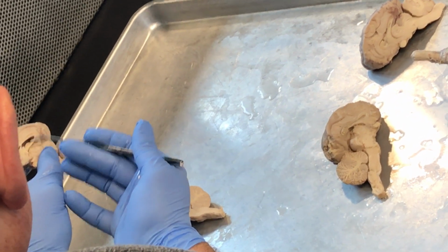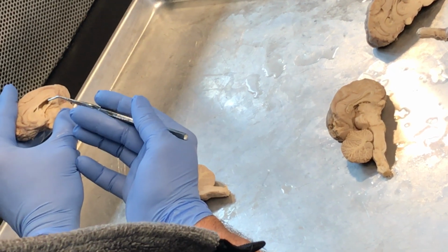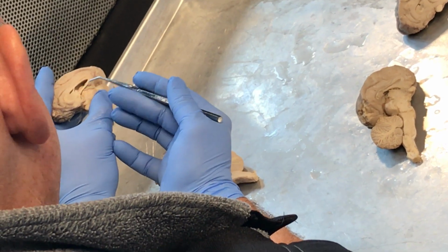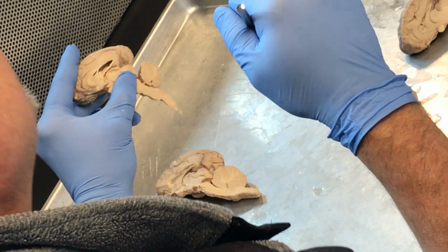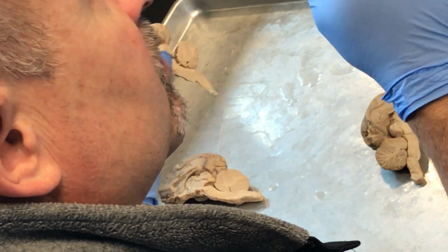That's this thing right here. I have a little saying: the fornix connects the hippo to the hypo. The fornix connects the hippocampus to the hypothalamus. It's just nothing but projection fibers. Remember we talked about the switchboard?